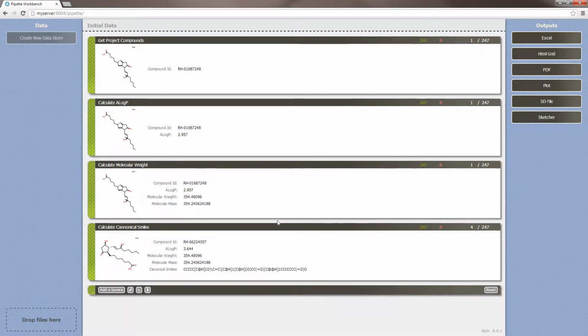The first thing we saw is how simple the interface was to the Get Project Compound service. Contrast this to other systems where they may need to run a search to find all compounds registered against their project, then a second search to find all compounds that have undergone a project-specific assay, and then finally merging both of these sets. By having the service set up by an expert who understands the data model, we avoid mistakes and save time for the scientist.